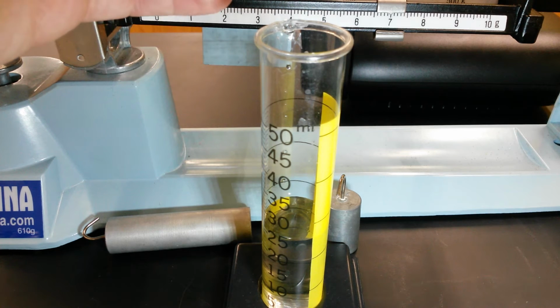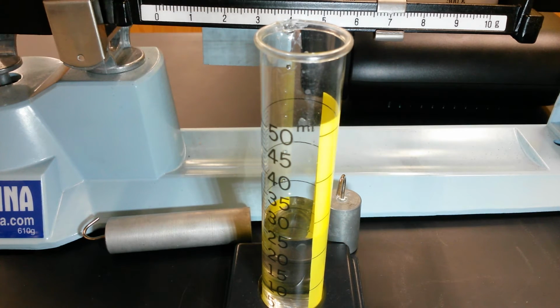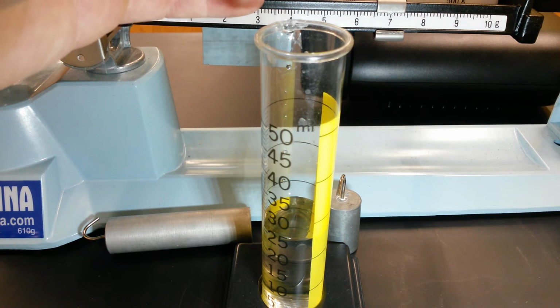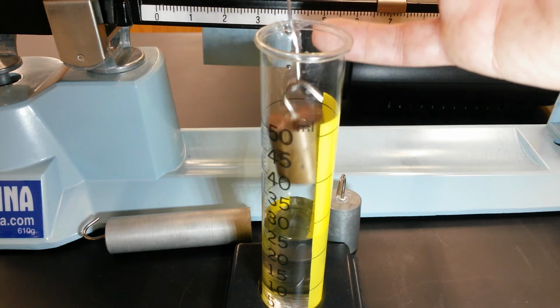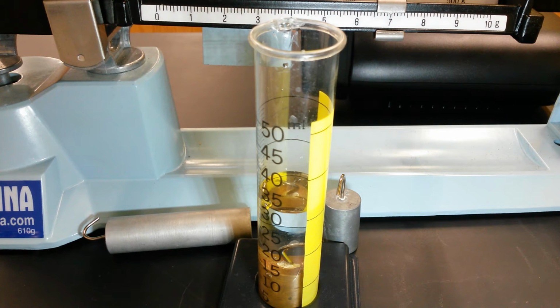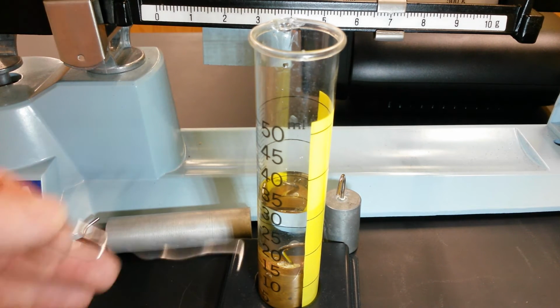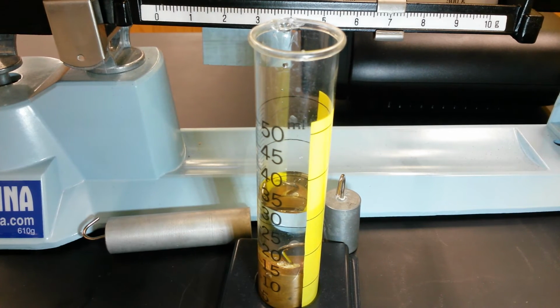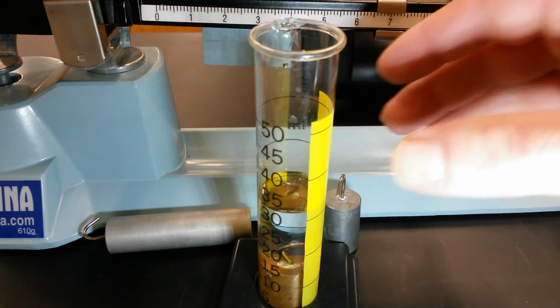Now, what I have here for you to use is a hook. That's just a paper clip, and that allows you to lower the object into the water without splashing any water out. Okay, so now once you drop the object in, you notice that the level of water went up. And so what you'll do is you'll take this volume that you have now and subtract from it the volume of the water originally, and that'll give you the volume of the object. Okay, so that's our measurement of volume.